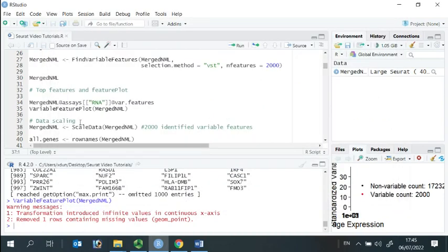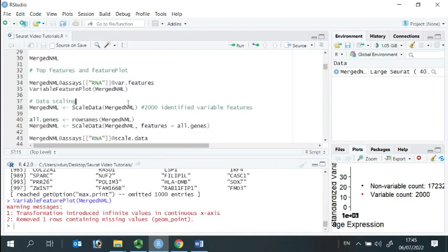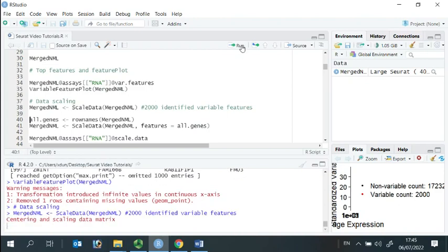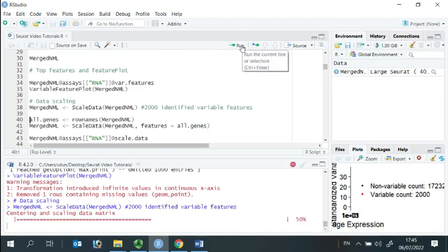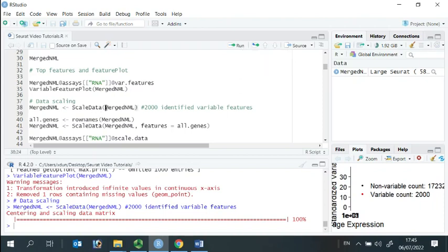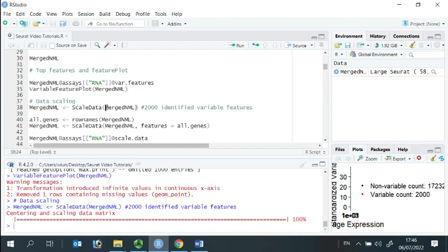Now we can run the last step of our standard processing workflow: data scaling. Data scaling is an essential step in the Seurat workflow. In the default settings for data scaling, we only use the 2,000 variable features. You can also run the scale data function on all genes, but this takes a longer time.